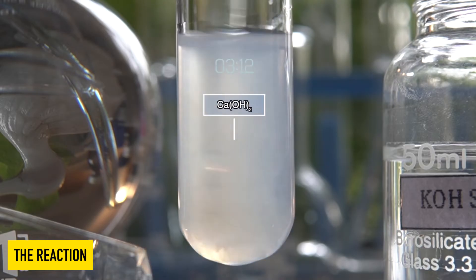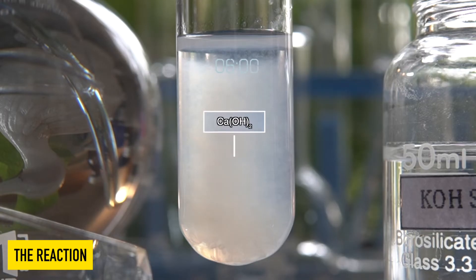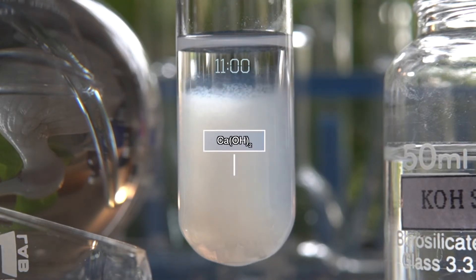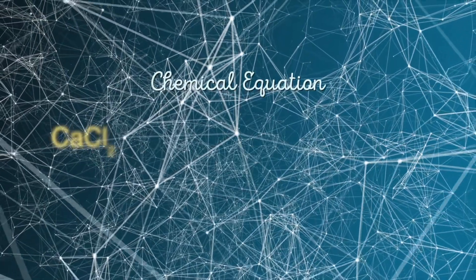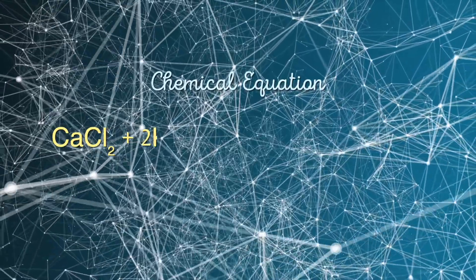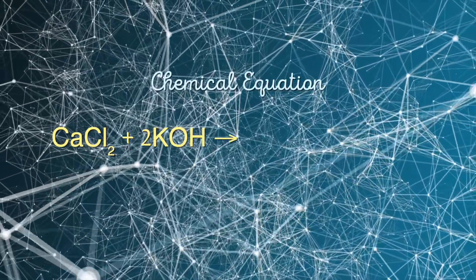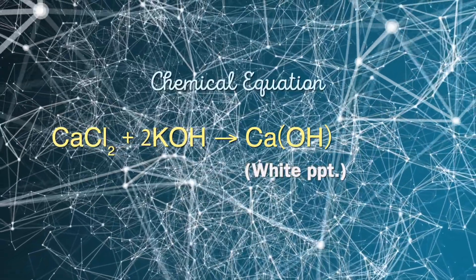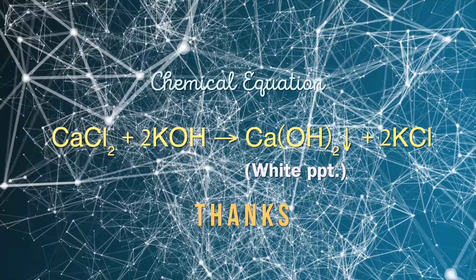This beautiful chemical reaction is a good example of a double displacement reaction. In this reaction, calcium chloride reacts with potassium hydroxide to produce a white precipitate of calcium hydroxide along with potassium chloride.